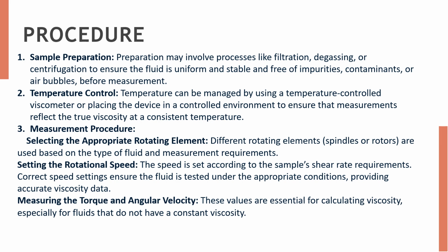The next is temperature control. As we all know, viscosity is temperature sensitive. So while using the viscometers, we have to make sure that the temperature is constant during the experiment. To achieve this, we use a temperature controlled viscometer, or we place the device in a temperature controlled environment so that we can get the true viscosity at that particular temperature.